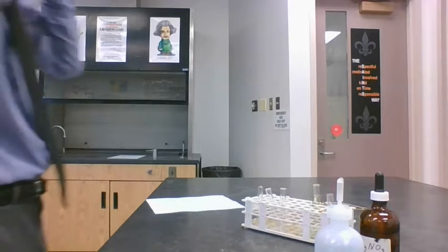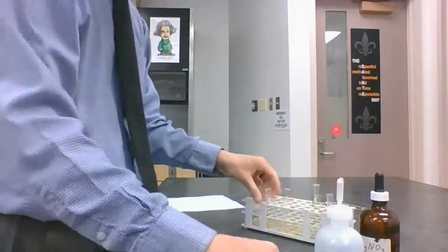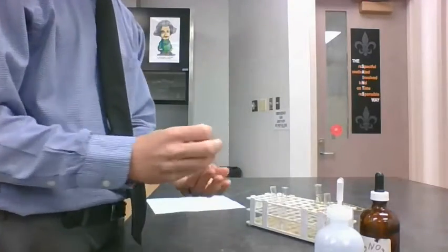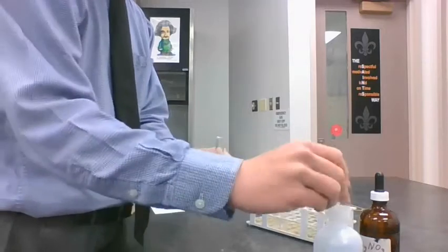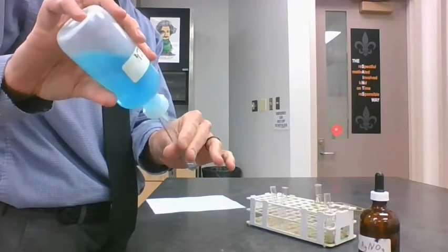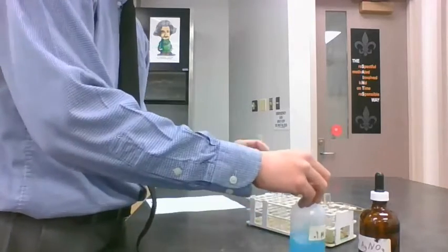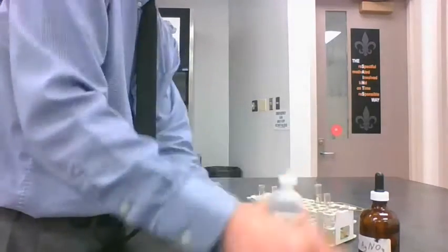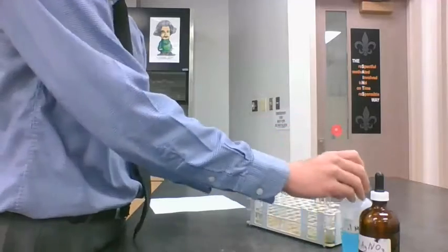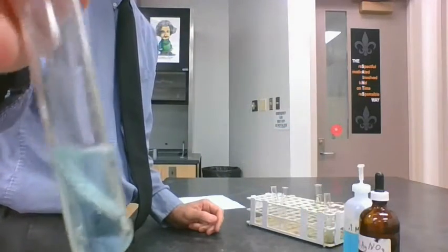All we're going to do in this first lab is mix the piece of magnesium in the test tube, and then add a little bit of copper chloride to that. So the piece of magnesium and then the blue liquid there.